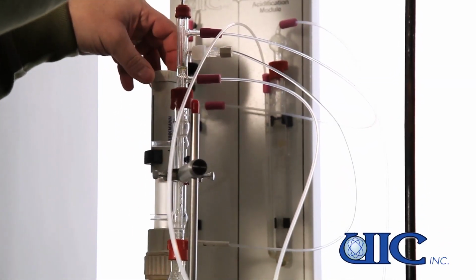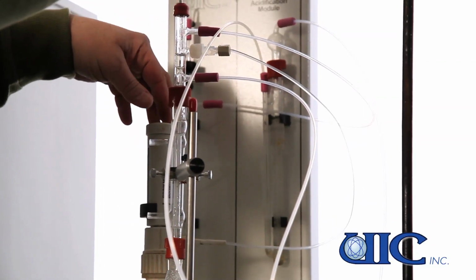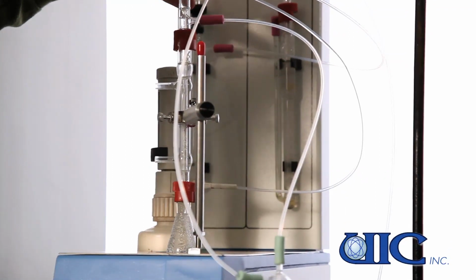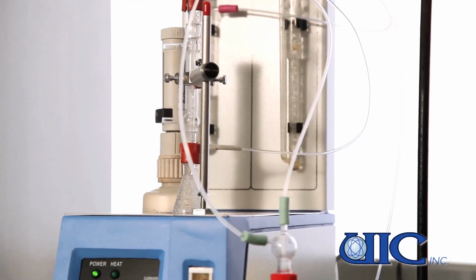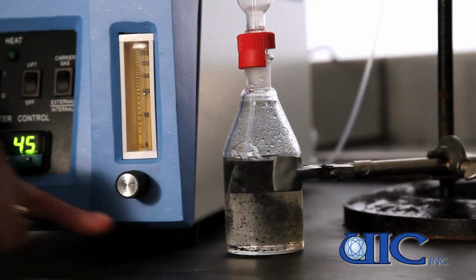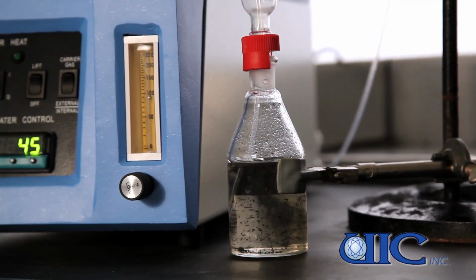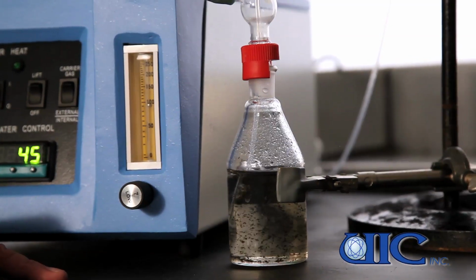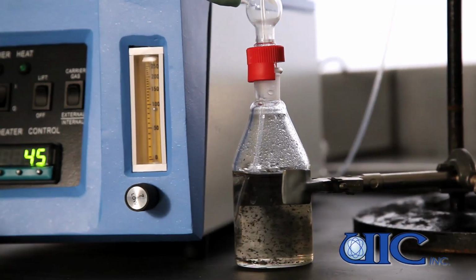Inject the sample and inject the acid. We can use the acid to flush off anything that might be on the end of the cylinder. We can see the post-scrubbers in black precipitate. That's obviously the hydrogen sulfide from the sample being scrubbed out. So you can see now why we use that larger post-scrubber.